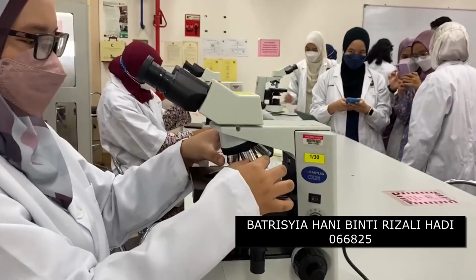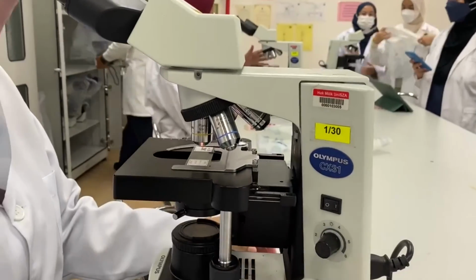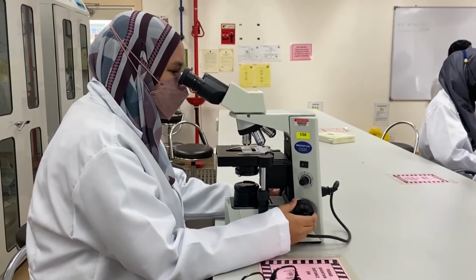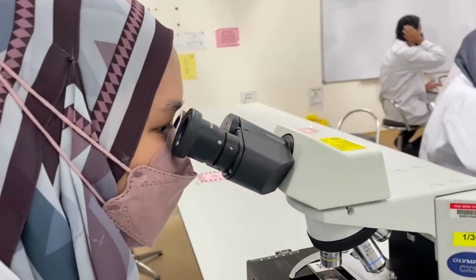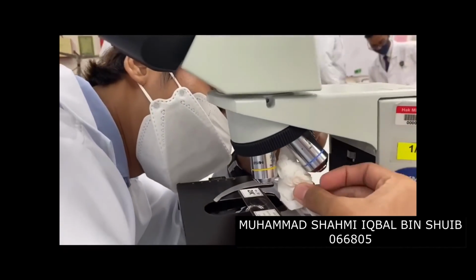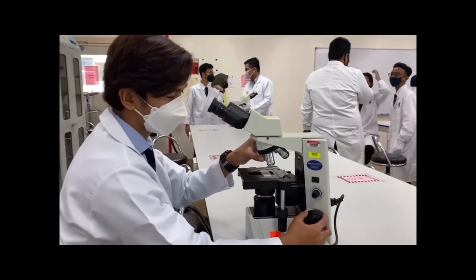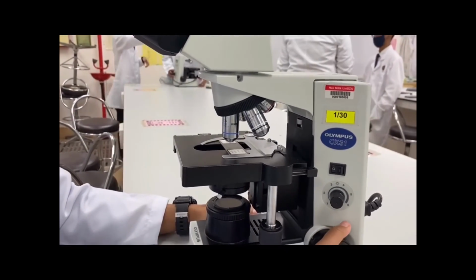Don't touch the lenses of the microscope with your finger as it could smudge the lenses. Don't wear a large amount of mascara when using a microscope, as the ocular lenses can become dirty easily. The next part is, don't try to clean the parts of the microscope that are difficult to reach unless you have been trained to do so. Lastly, make sure you don't let the lens of the microscope kiss the slide of the specimen.